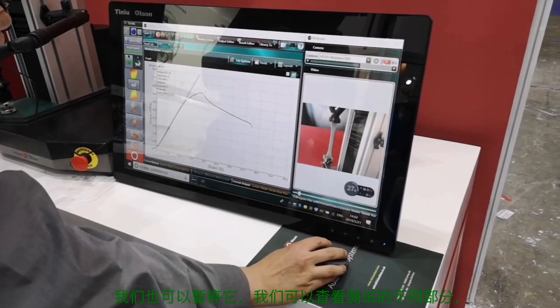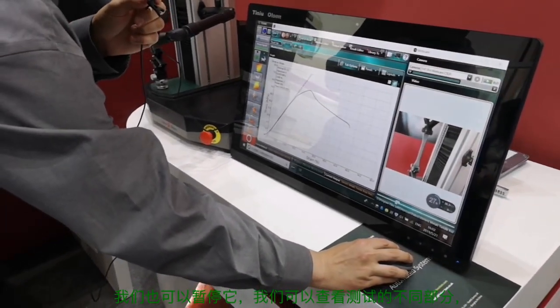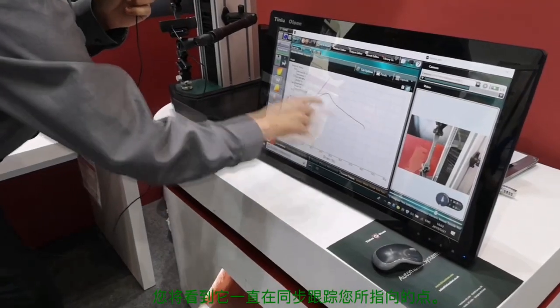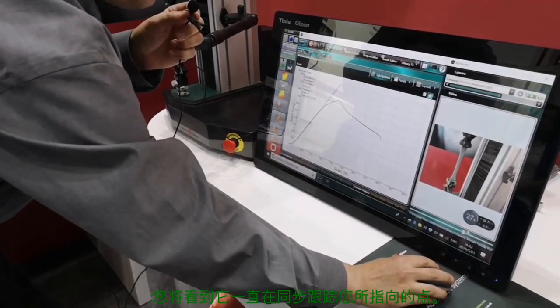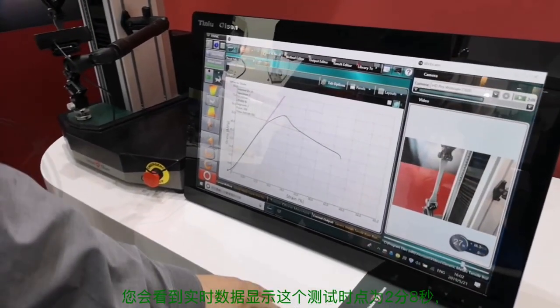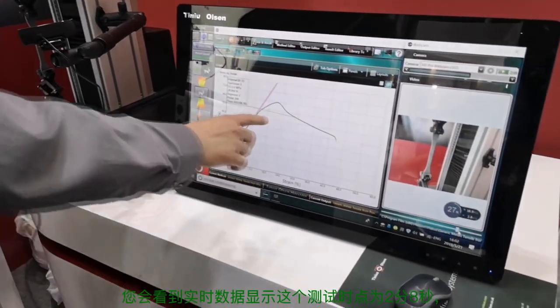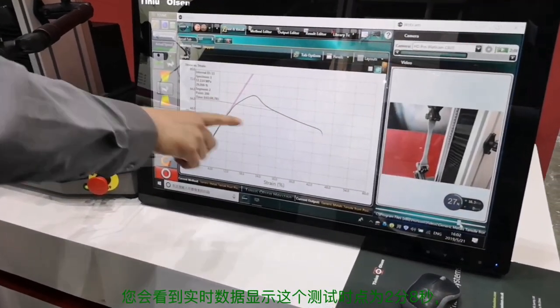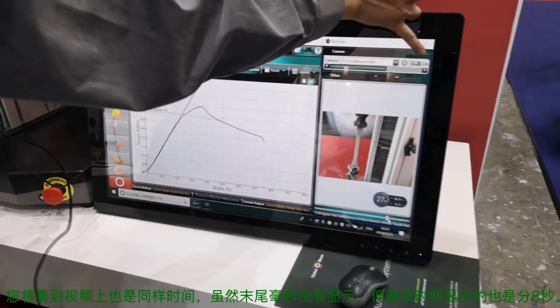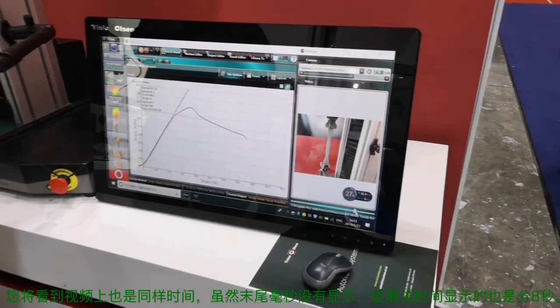We can also pause that and scroll over to a different part of the test, and you will see that it's keeping track of the point you're pointed to. The live data shows that at this point it's 2 minutes and 8 seconds into the test, and you'll see the video agrees — it's 2 minutes and 8 seconds into the test.